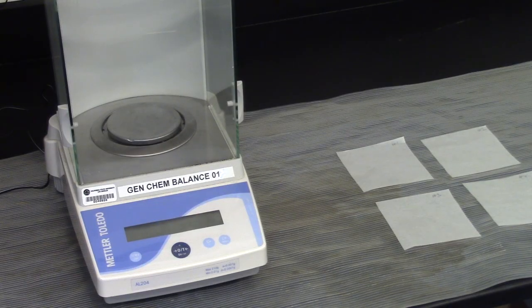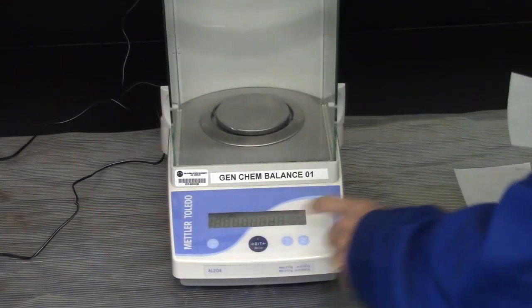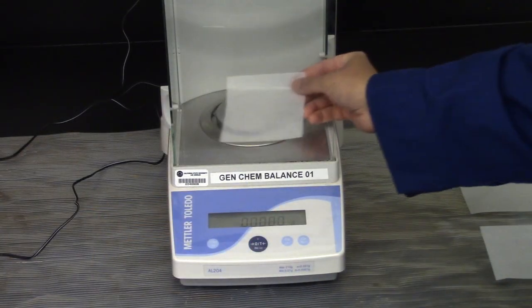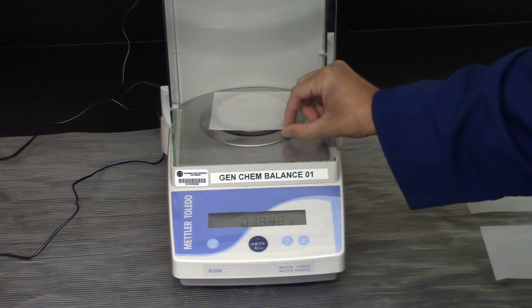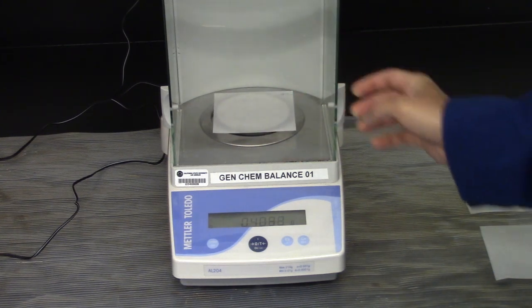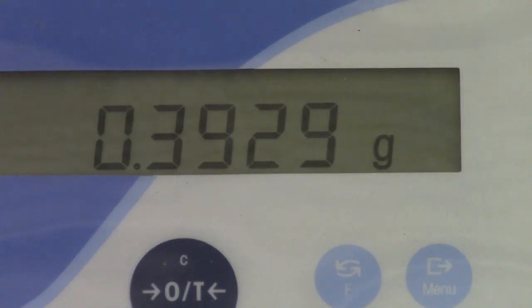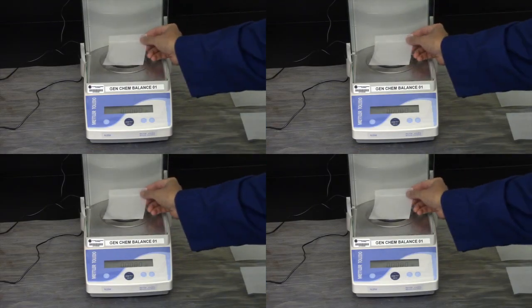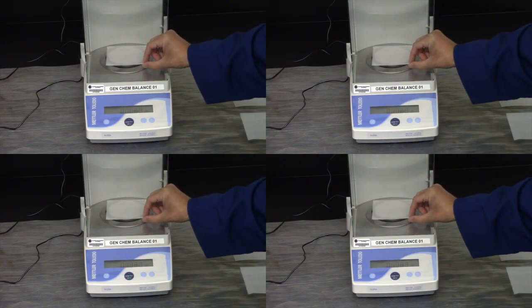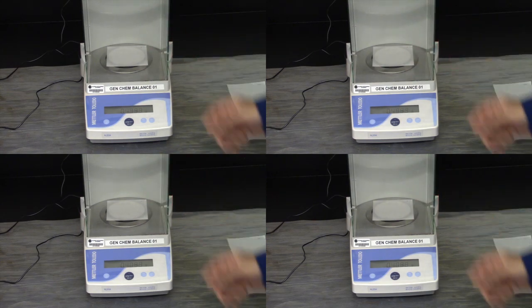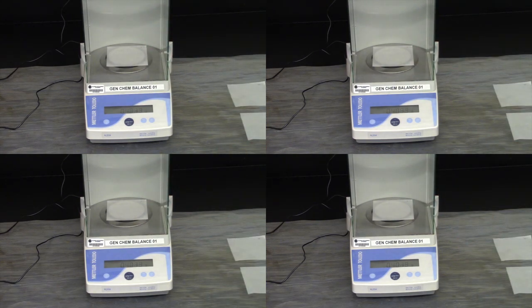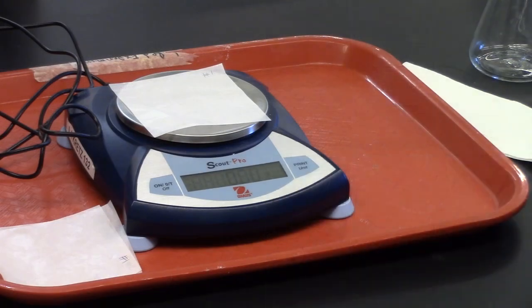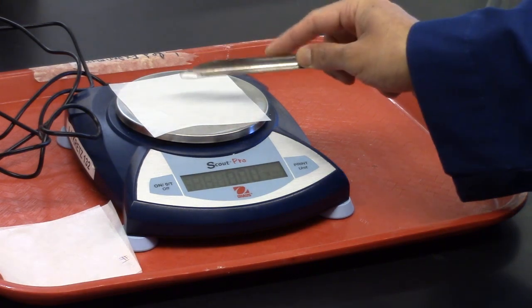Using an analytical balance weigh four labeled weighing papers. Two for the commercial and two for the synthesized sodium hydrogen carbonate. Record masses and balance number. Two samples will be for the controlled commercial sodium hydrogen carbonate and the remaining two will be for the synthesized. Transfers are not allowed in the analytical balance room. Return to the lab.